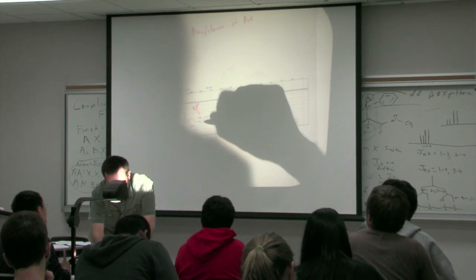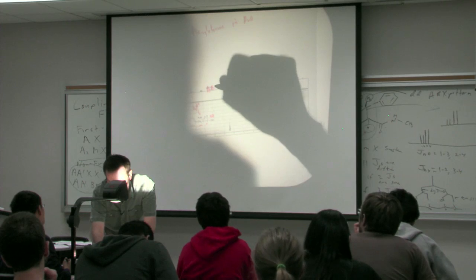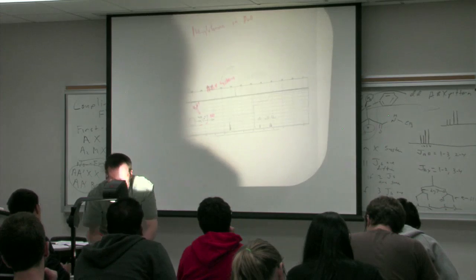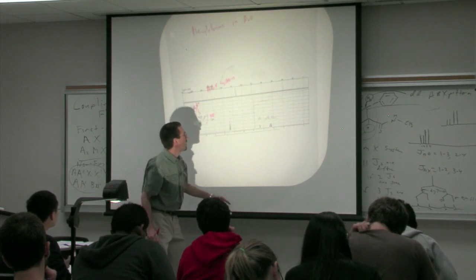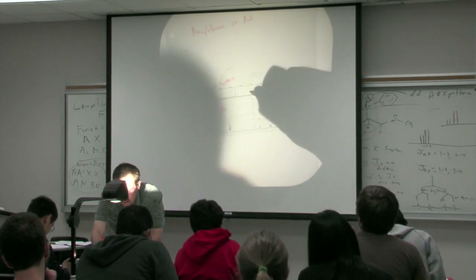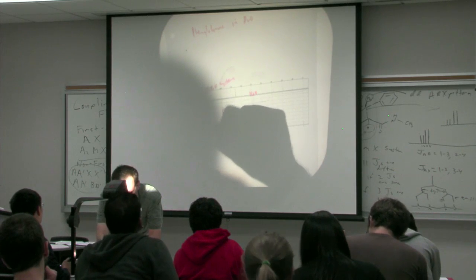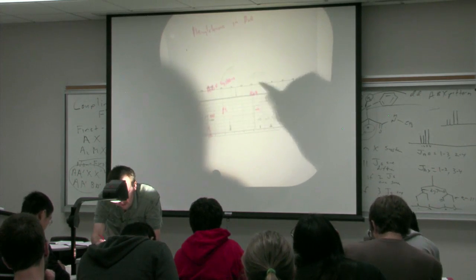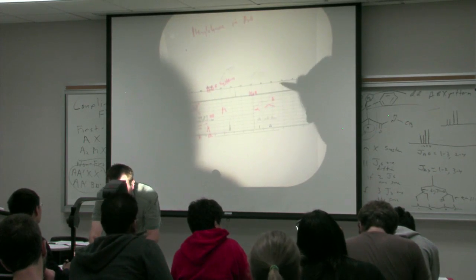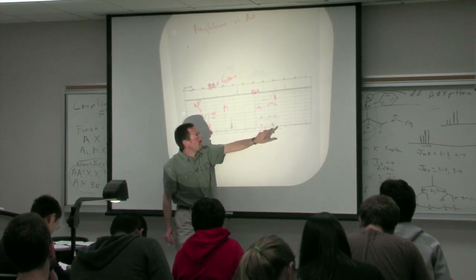So what remains in this system are the two methylenes and the methines, so this is an ABX system. And so you see coupling here, and this is your phenyls, and this is your HOD, and this is your alpha proton, and these are your beta protons. And so this is a very real example of what I've sketched out.